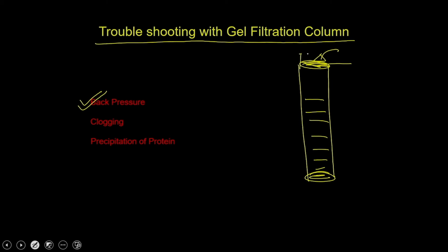So, what do you have to do? You have to clean these filters using some cleaning agents, and you can also remove these filters and clean them. That will take care of the back pressure problems.